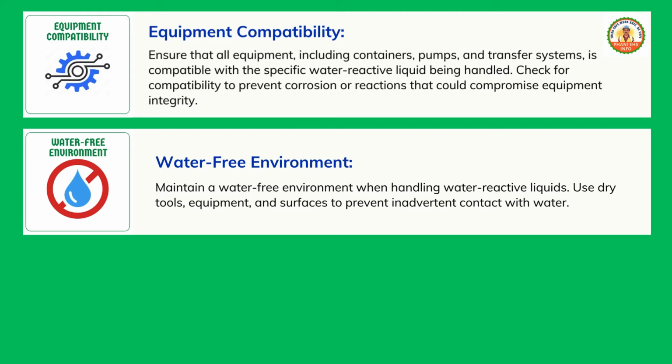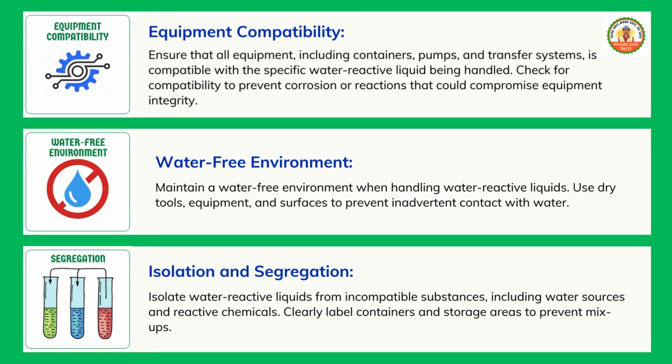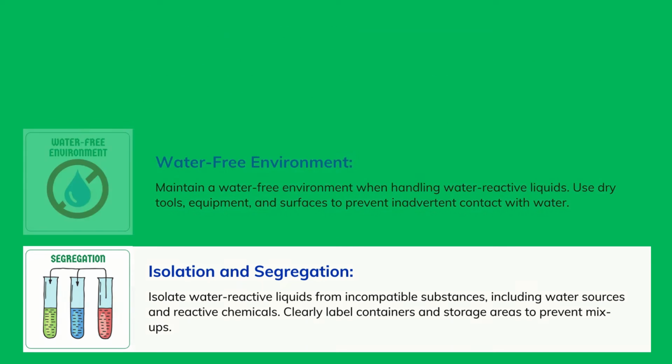Isolation and segregation. Isolate water-reactive liquids from incompatible substances, including water sources and reactive chemicals. Clearly label containers and storage areas to prevent mix-ups.